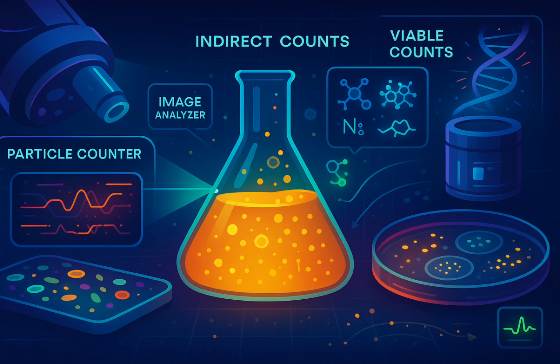The potential plus is selectivity. You might tell it only count things this big and ignore smaller stuff. But the downsides: still have the microscopy issues, like getting an even spread. The software can be pricey. And analyzing lots of images for many samples can still take a fair bit of time.